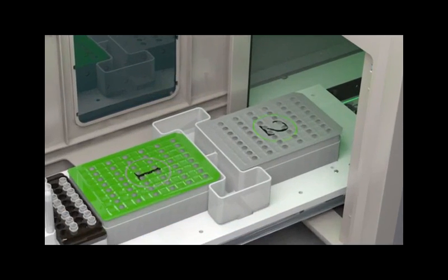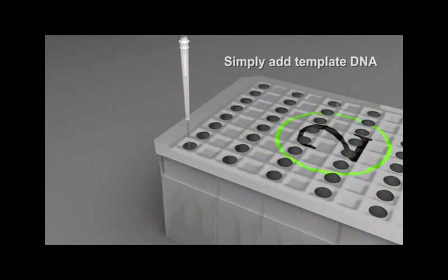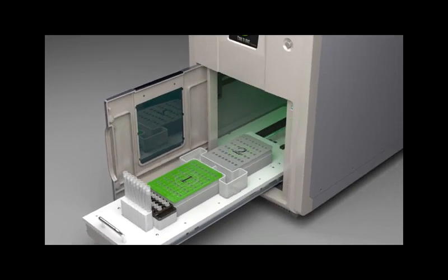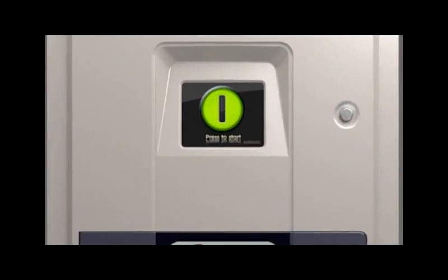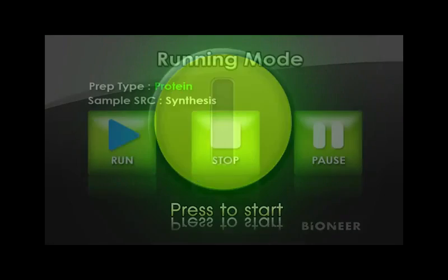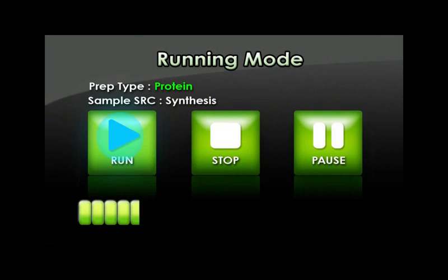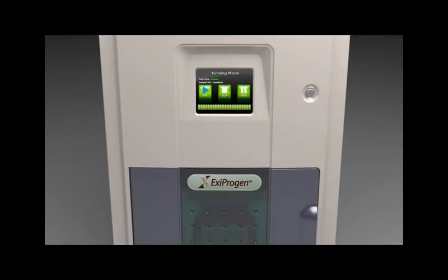To get started, you simply add 5 to 10 micrograms of template DNA to the expression cartridge. 1 to 16 different proteins can be synthesized and purified using Exiprogen. To start the protocol from the convenient touch screen, simply enter the protocol number and press Run.